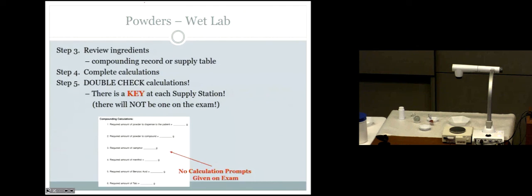Looking at your wet lab section in your packet, in the calculation section, I do guide you. I do suggest for you what calculations to do. I will not do that on the test, but today they're there. When you go out there and do your own calculations, what I don't want you to do is make it wrong because you did the calculation wrong. So I have posted keys with these calculation answers that you can check your answer against before you go and make it.